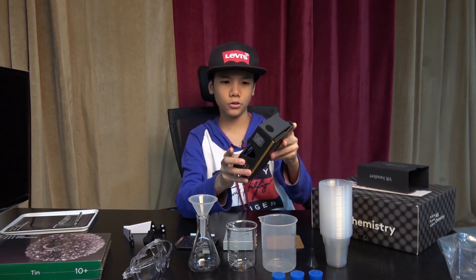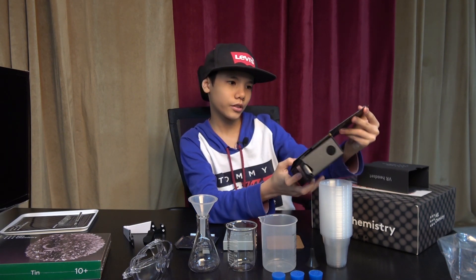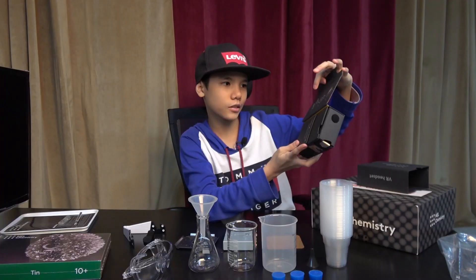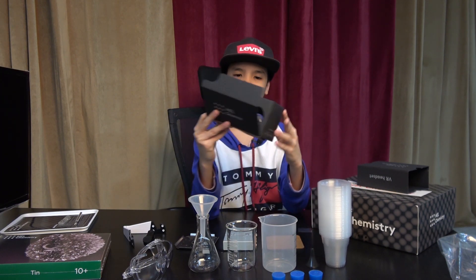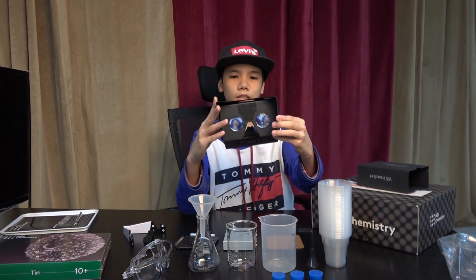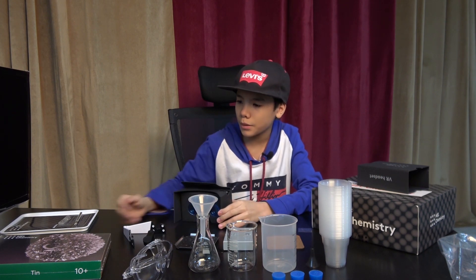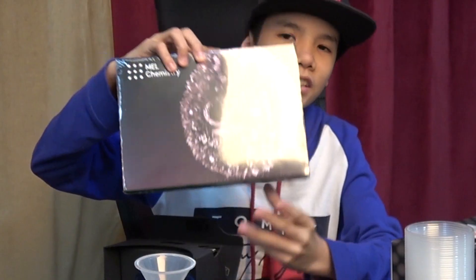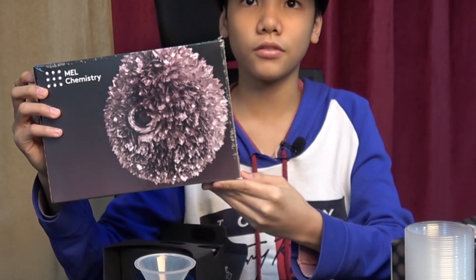There's a strap with velcro and it shows you how to assemble it. In future videos we'll show you guys how to use this VR thing — it's pretty neat assembly. If you want to see us do the experiment with this, we're going to make a separate video for that. That's it for today's video — Assalamualaikum warahmatullahi wabarakatuh.